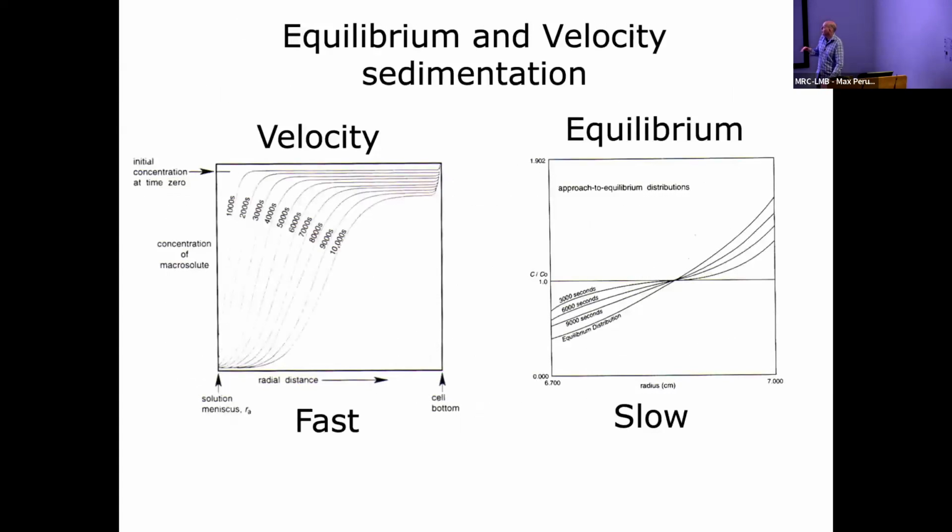Right, so two types of experiment. One, we're going to just sediment very fast. The other one will be in equilibrium.